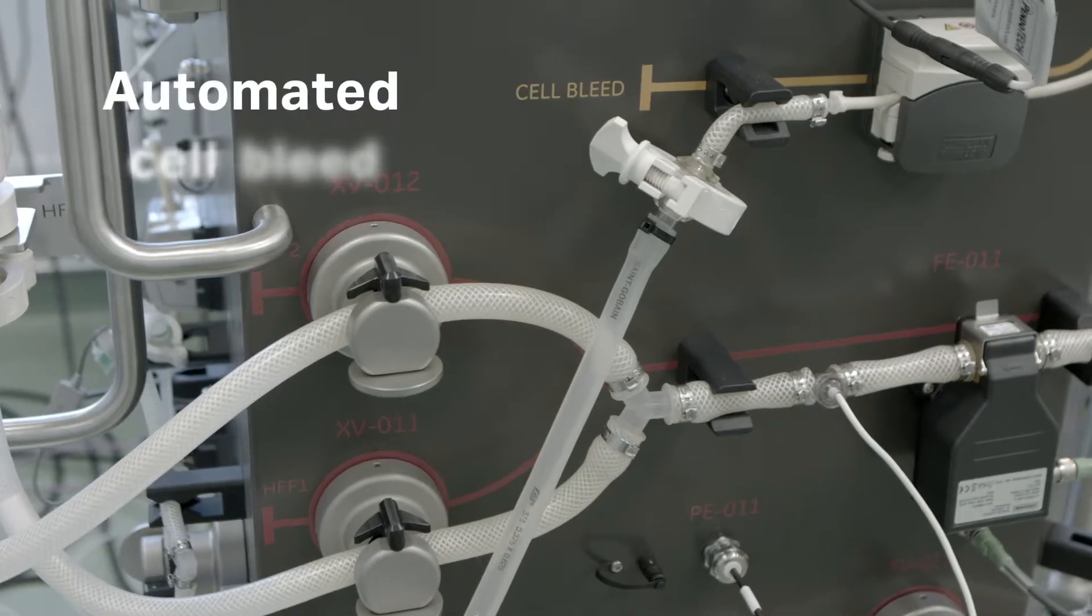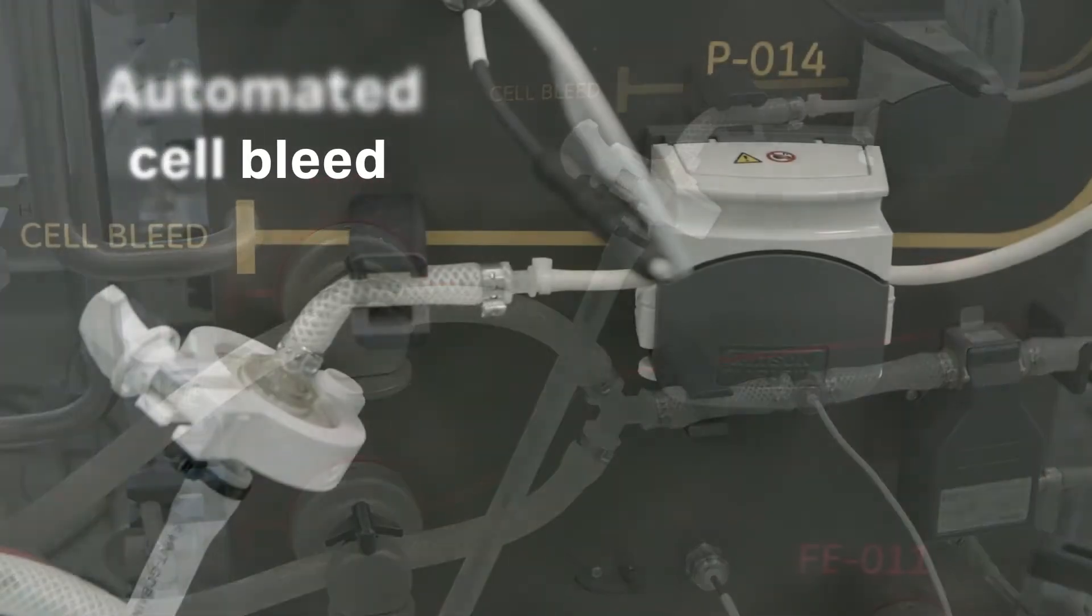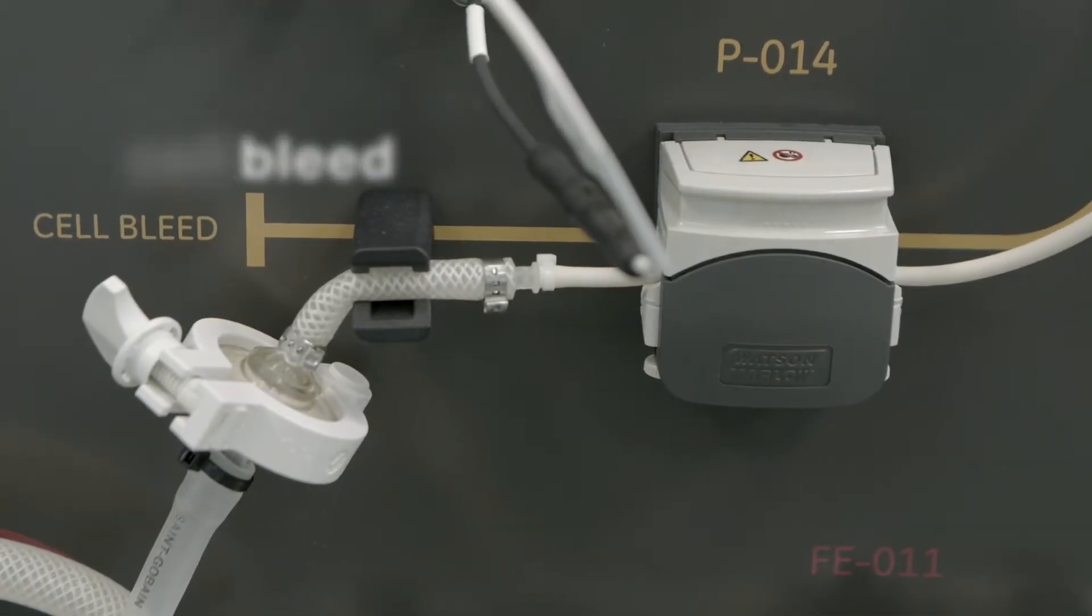To ensure continuous cell culture and maintain constant cell density, the APS automates cell bleed.